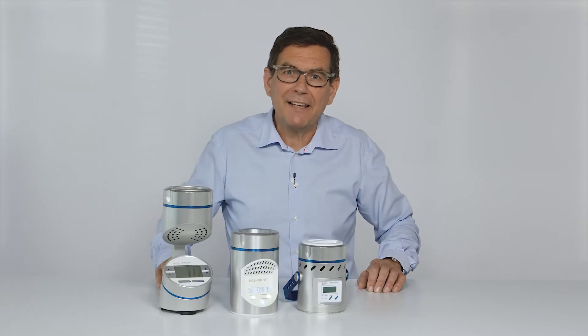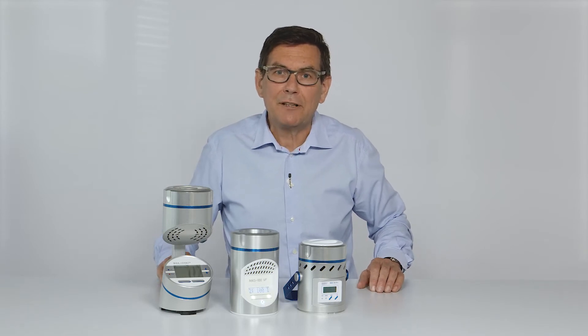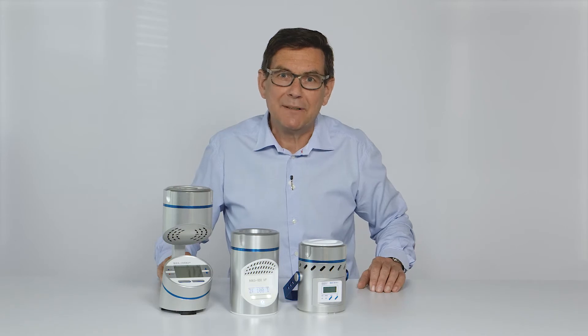To stay compliant with GMP and other guidelines, the airflow of microbial air samplers has to be calibrated regularly. The calibration reminder in MAS 100 air samplers makes sure that you never forget to calibrate your instrument in time.